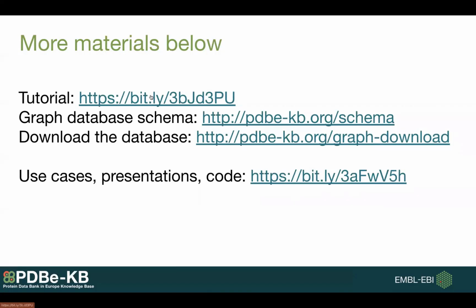We also have a tutorial that you could visit and learn how to retrieve the database, how to set it up. Actually, it's quite straightforward to set this up, and how to write queries. You can also look at the database schema, which tells you what exactly we have in the graph and what nodes and what edges are there. And like I said, you can download the complete database, which is refreshed every week. So every week it's up to date.